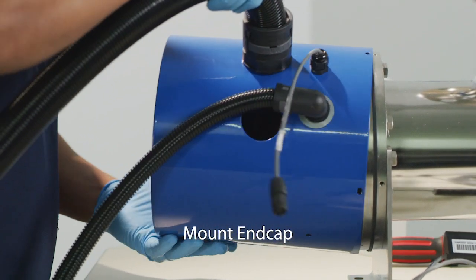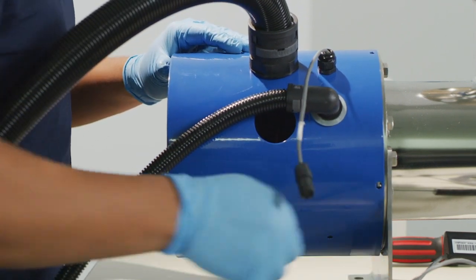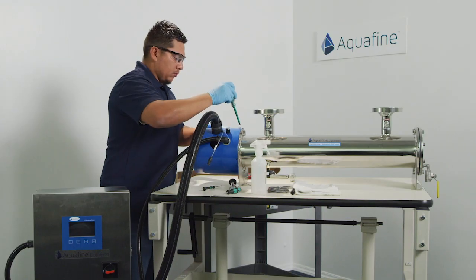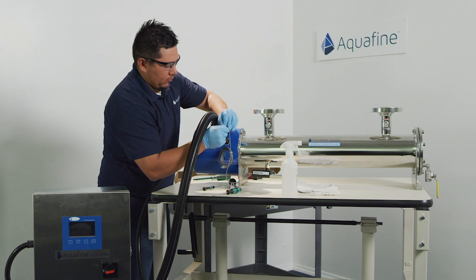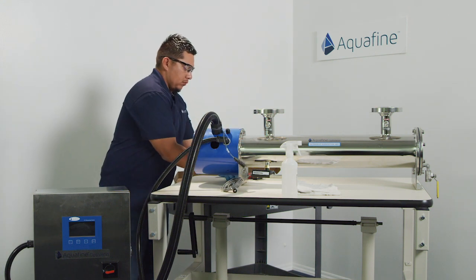There are three securing holes on the end cap — left, top, and right — that will match up to the chamber flange. Re-secure using the appropriate screws. Tighten by hand only. Re-attach the sensor cable using its quick disconnects.